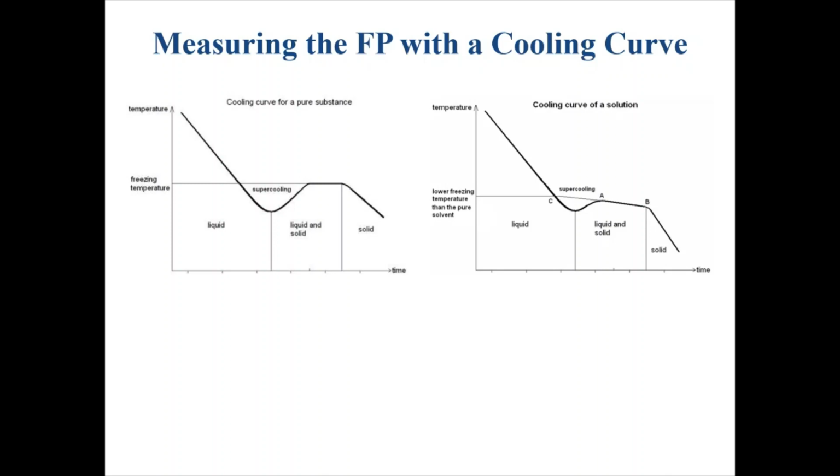So this would be the water, and as the water is freezing out, the solution that's left behind is becoming ever more concentrated with that salt that's left behind. So the concentration is increasing, and as the concentration increases, the freezing point is going to go down, right? With freezing point depression, the more concentrated the solution becomes, the lower the freezing point will be. And that's what we're seeing. As we freeze out the ice, the solution that's left over gets more and more concentrated, and that's why we get a sloped freezing point.